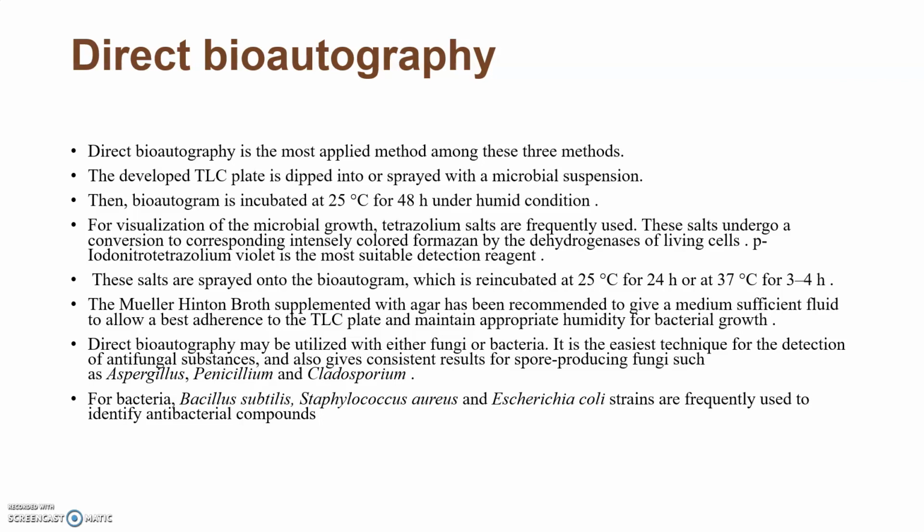The developed TLC plate is dipped into or sprayed with microbial suspension. Then the bioautogram is incubated at 25 degrees Celsius for 48 hours under humid conditions. For visualization of the microbial growth, tetrazolium salts are frequently used. These salts undergo conversion to the corresponding intensely colored formazan by dehydrogenases of living cells.